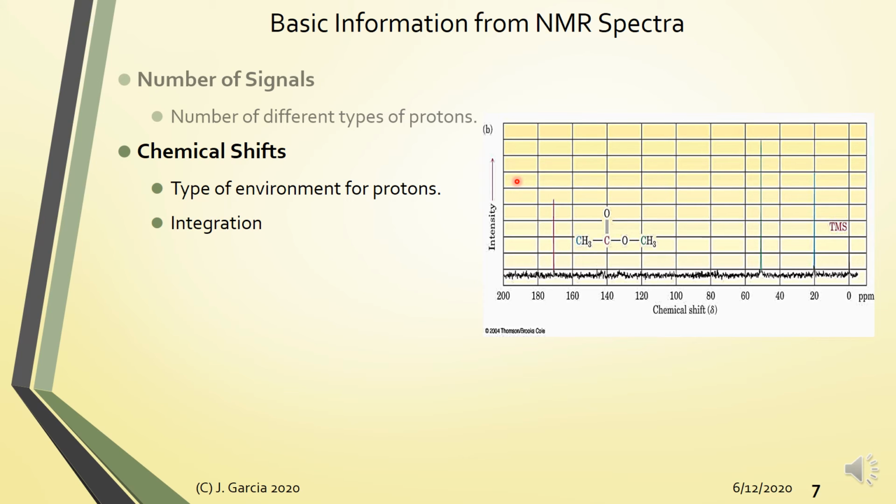Well, sa proton NMR, there's another special data that can be obtained, and it's what you refer to as the integration. Kung maaalala, ito yung mga lumalabas sa parang S-curve sa ibabaw ng peaks. So the length of this S-curve is associated with the proton ratio for that particular signal, and it will give you an idea what type of hydrogen you have in the organic molecule.